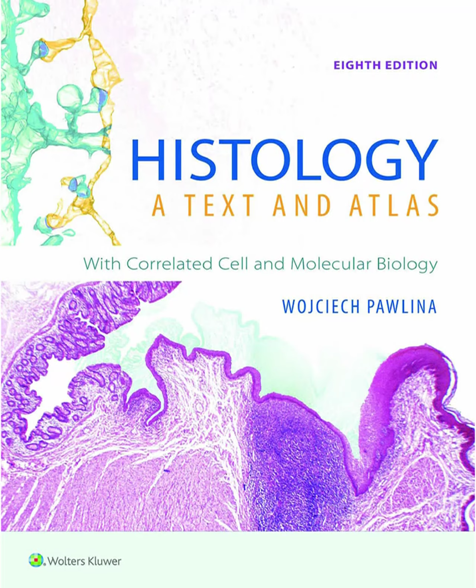What about other fixatives or stains? Well, for electron microscopy, which gives us much higher resolution, Right, the really zoomed-in view, we need even more specialized fixatives. Something like osmium tetroxide is essential. It binds beautifully to phospholipids, the main components of cell membranes. It preserves those delicate membrane structures and adds electron density, which makes them visible under the electron beam. Without it, membranes are hard to see in EM.